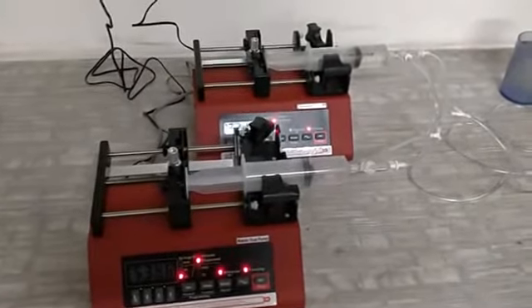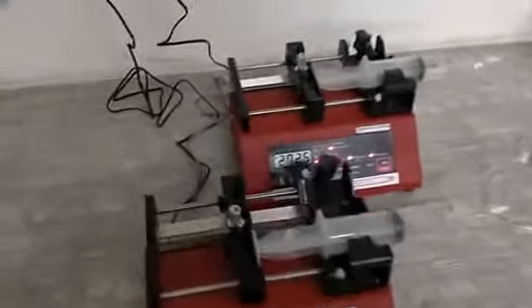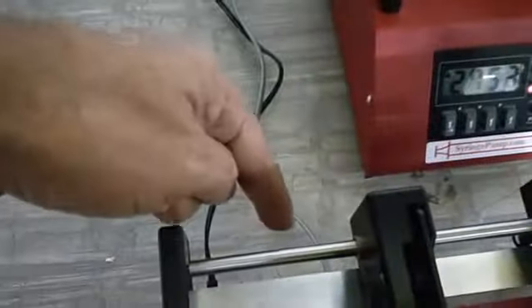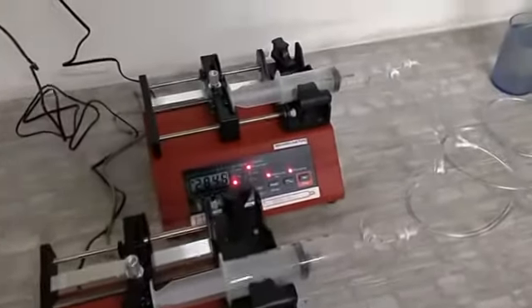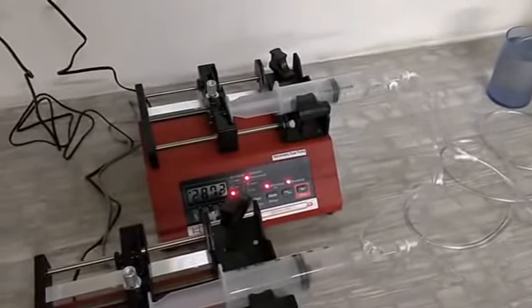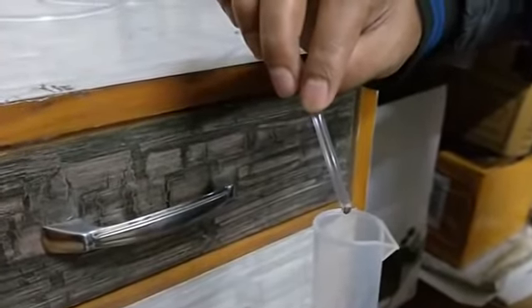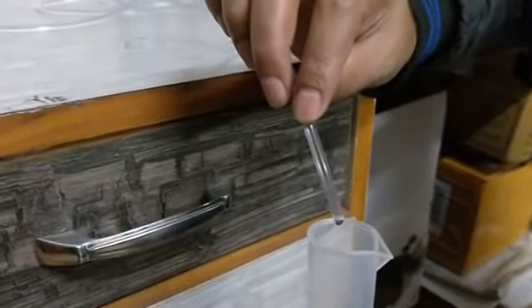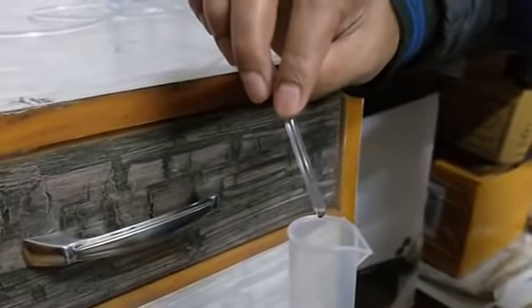In the continuous mode, as you can see in the setup, the only thing we require is two pumps, one cable which connects from one pump to the other, and one PD kit. In dual mode, one pump infuses and the second pump withdraws, and when the first pump withdraws, the second pump infuses. From the output, we always get flow because this is a microfluidic pump, where the maximum flow is very, very low — say 0.5 microliter per minute.